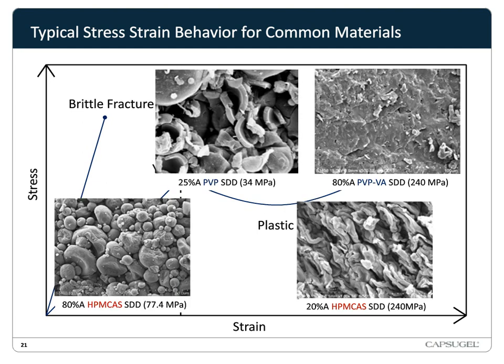This slide shows some SEM micrograph cross-sections of compacts with different SDD materials. Depending on the formulation, the magnitude of these behaviors, the fracture, the plastic and elastic, can be engineered into the SDD particles.